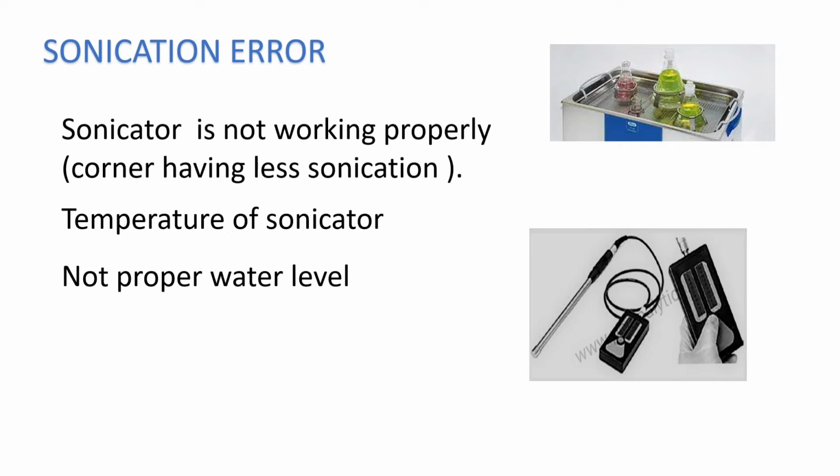So the flow of the water should be such that the water level is maintained, water comes inside the sonicator and is drained out of the sonicator. In this way, with continuous water supply coming in and going out, the temperature of the water can be maintained. If you want to avoid this, you can use a sonicator which has a cooling system. That is also a good idea.